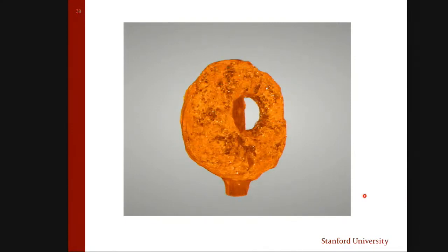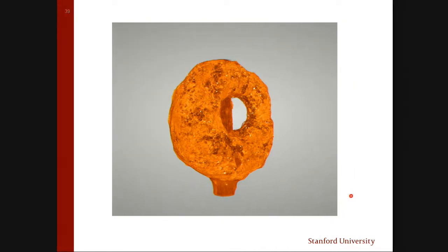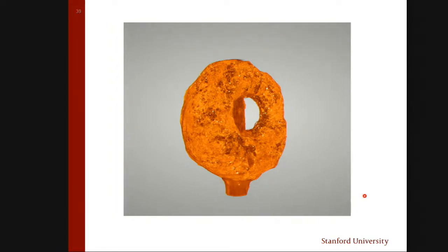I have other instruments, which are X-ray diffraction instruments, and they work in reciprocal space. Nobody is interested in seeing objects in reciprocal space. If you don't understand it, it's boring. But these, everybody would understand. The same as scanning electron microscopy, everybody likes the images, right?